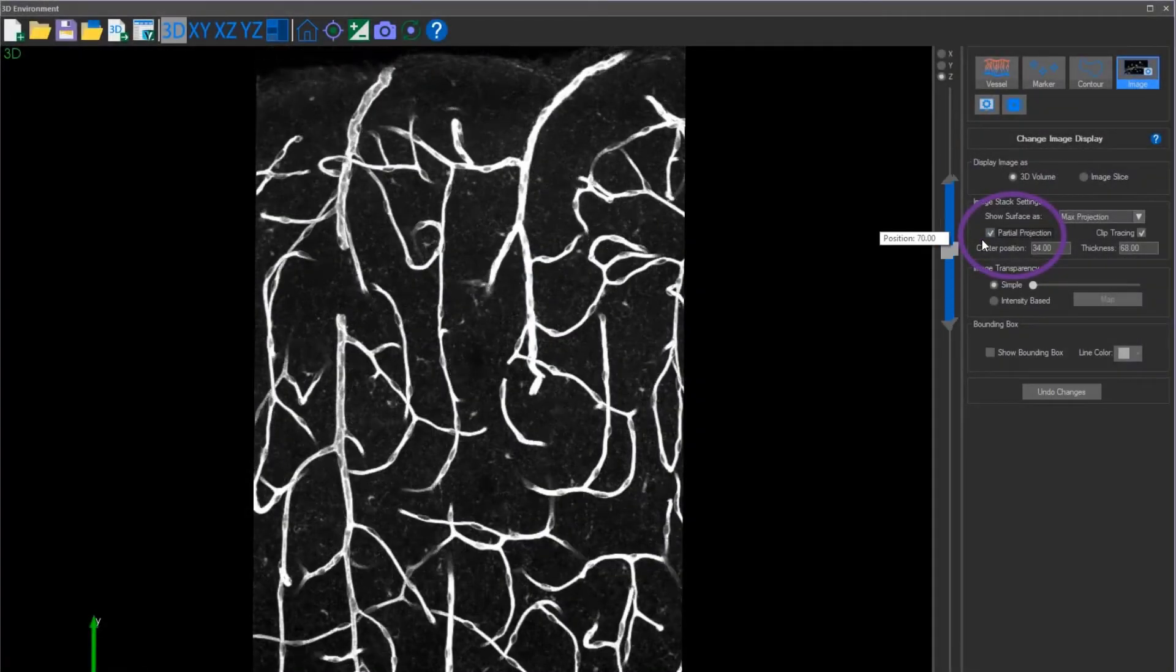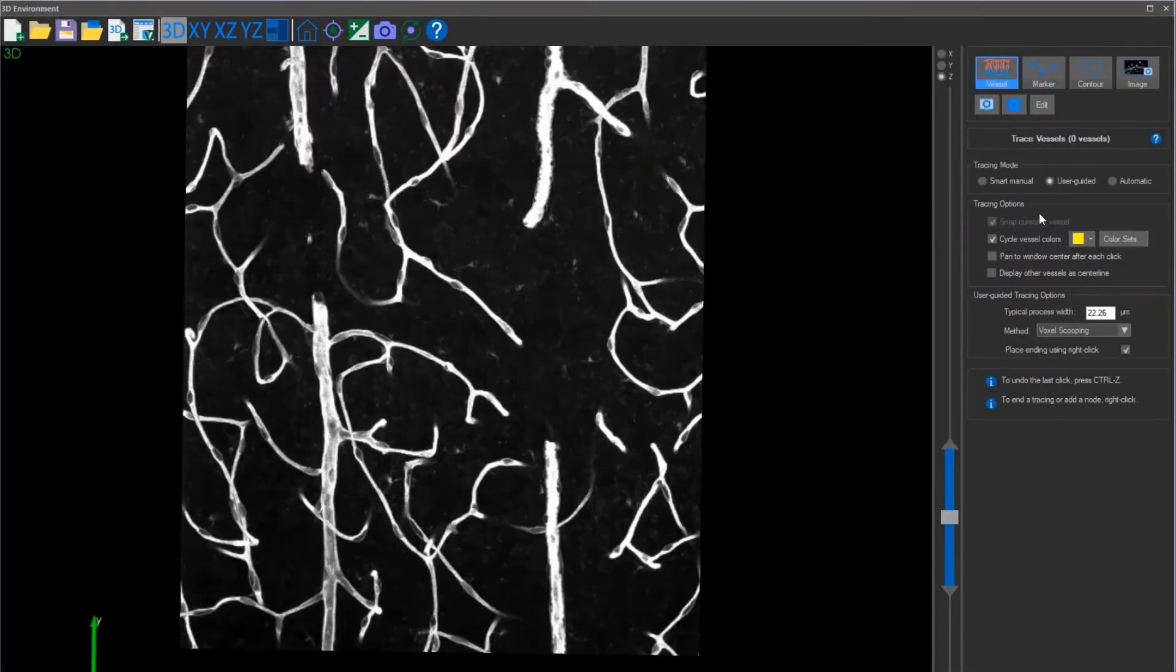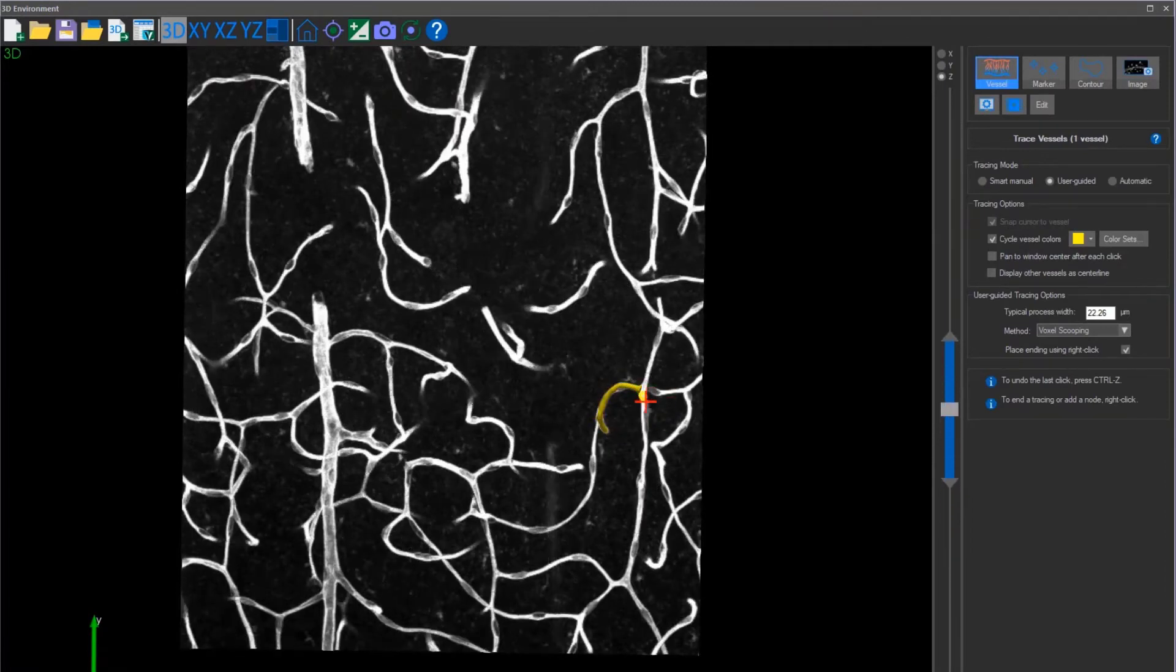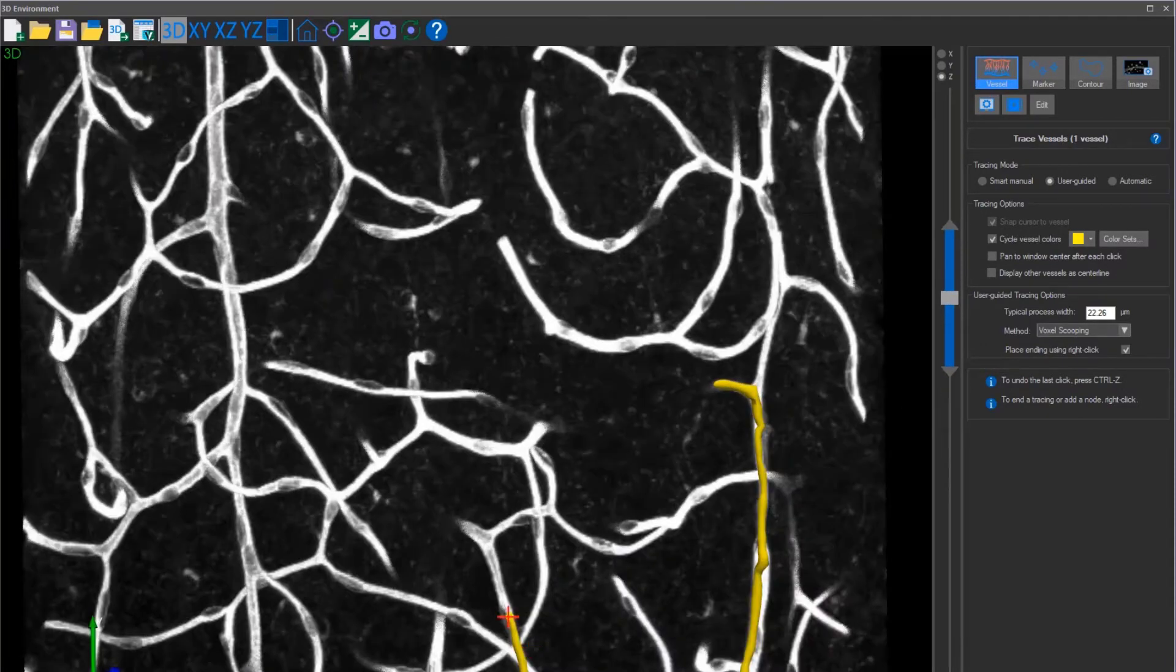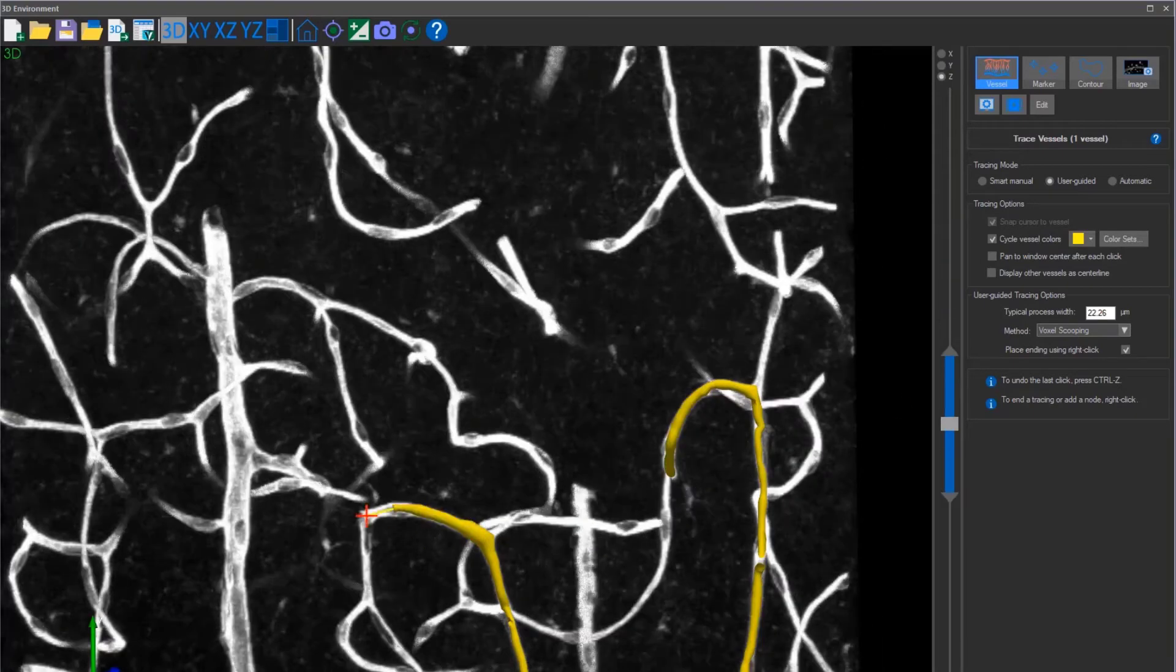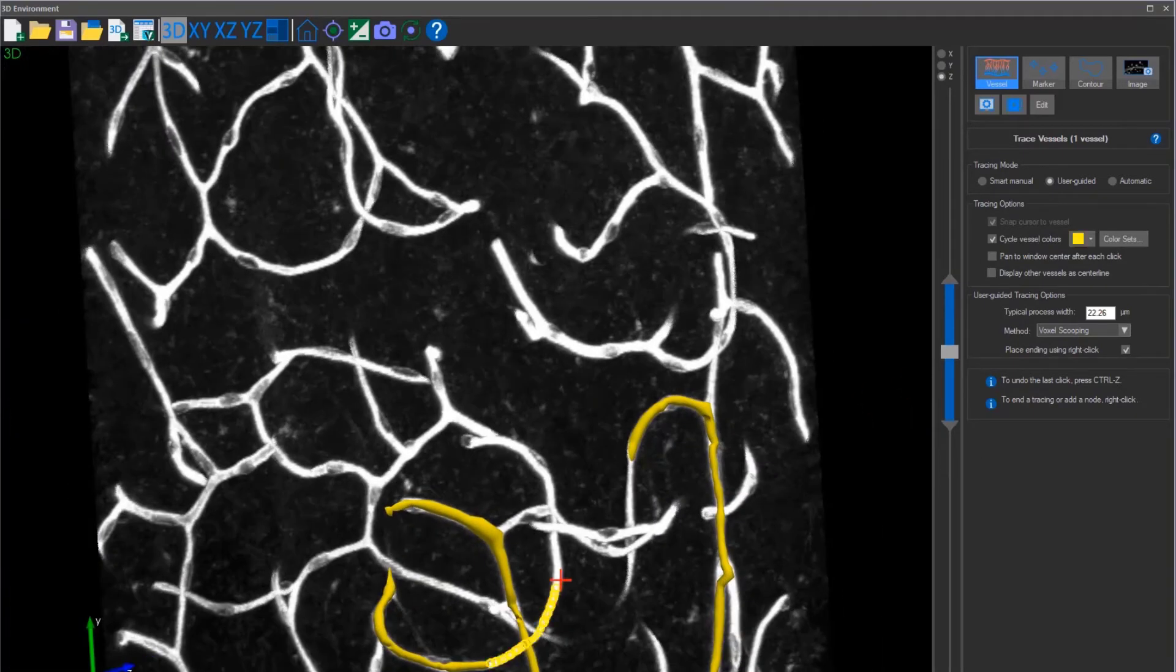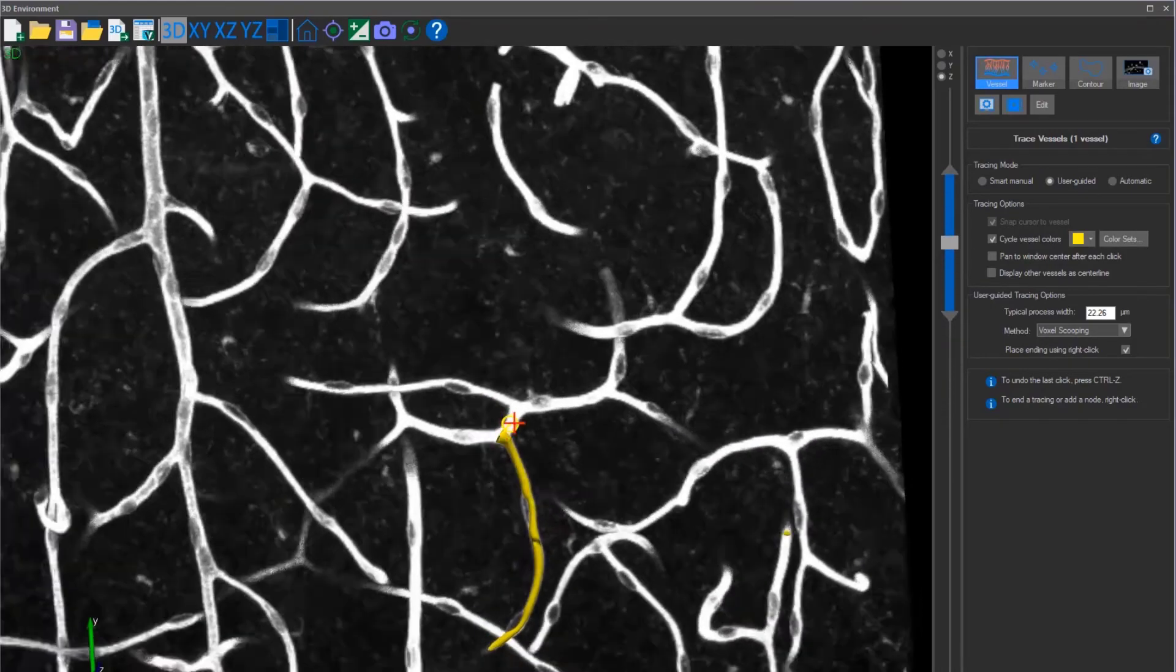Veselucida 360's partial projection tool is perfect for editing and reconstructing the microvascular image. It works by limiting the amount of data that is being shown in the 3D window at one time. With partial projection, the workspace becomes less complex, giving you a better understanding of where the vessels are and how to connect them, making your time reconstructing and editing much more efficient.